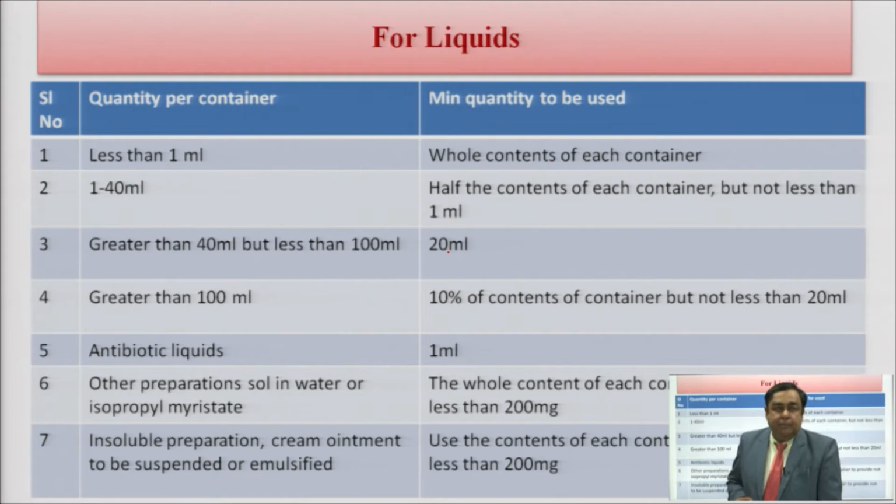If the preparation is antibiotic in nature, we need to deactivate the compound, we need to mask that compound so that it does not prevent the growth of microorganisms if they are present. If any compound which you are testing has an antimicrobial action, you need to block or mask the antimicrobial property by any method, it may be a chemical or an enzymatic method, so that the compound does not exhibit any antimicrobial action against the contaminant.